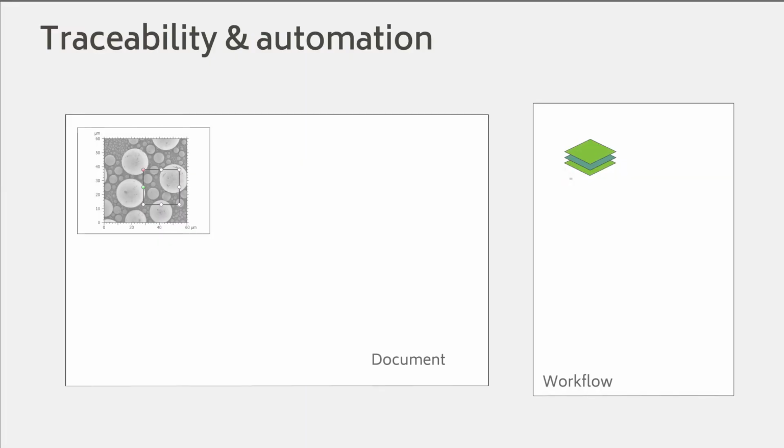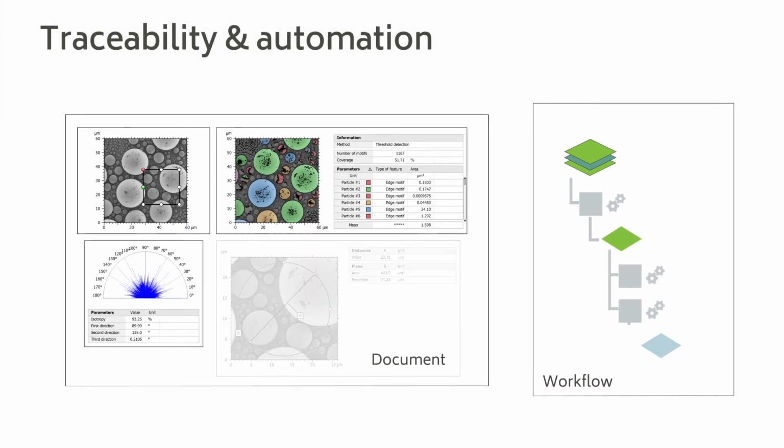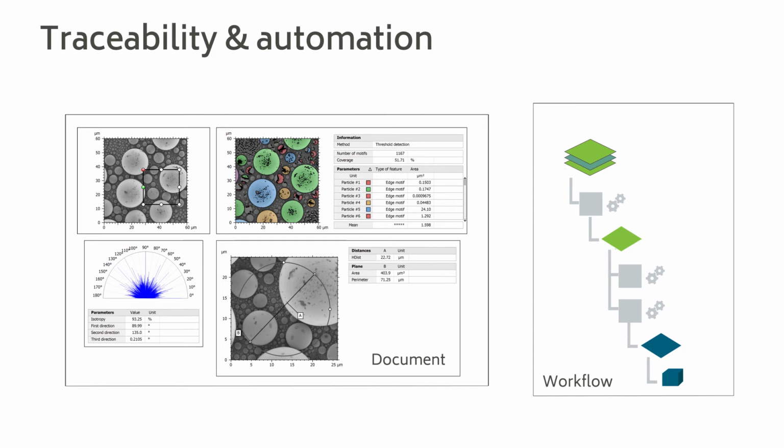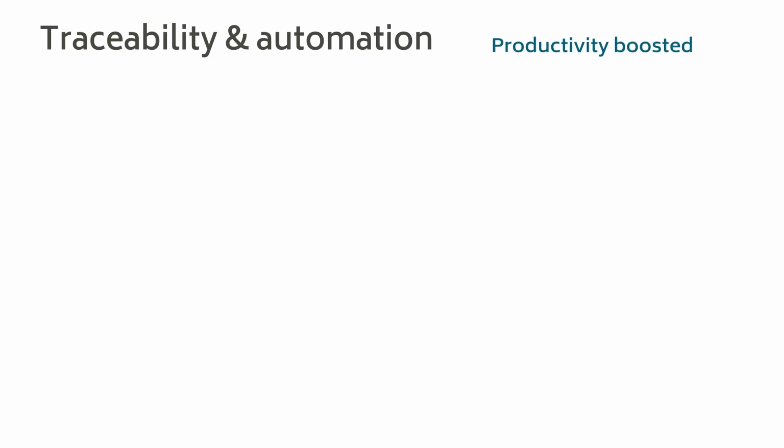Well, definitely the most appreciated, I think, for customers is the workflow analysis tool. This allows customers to see what automatically is saved in each analysis, and that's used as a template to go back and use it to apply to new analyses.